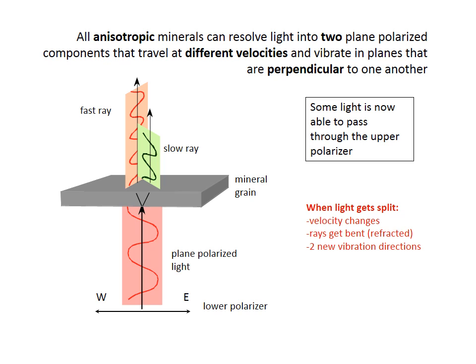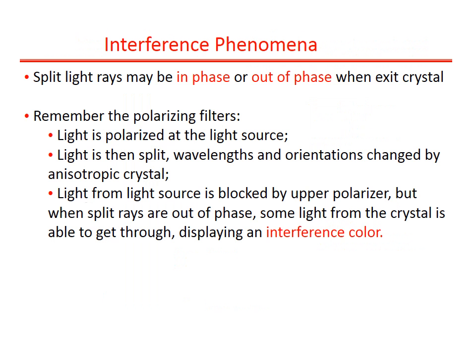So note that now there are two light rays exiting, both towards your eye, where before there was only one. Some component of both of these rays will pass through the analyzer, the upper polarizer that's oriented north-south. Your eye will see a composite wave formed by the interference pattern when they're added together into a single waveform with constructive and destructive wave interference by your brain.